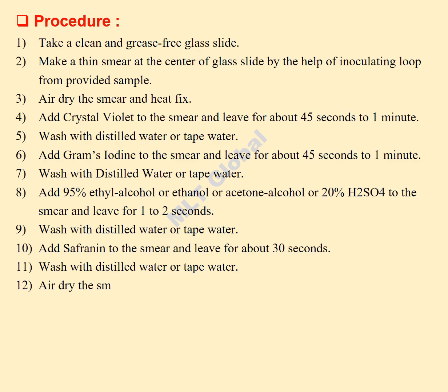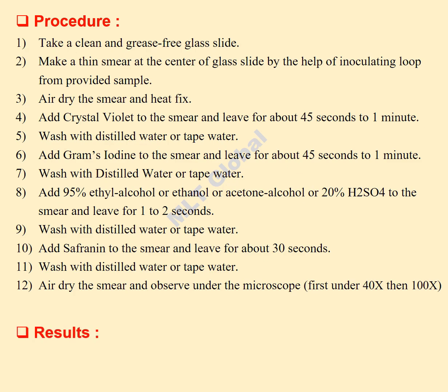Air dry the smear and observe under the microscope, first under 40x, then 100x. Results. Gram positive: violet color, blue color, purple color. Gram negative: pink color, red color.